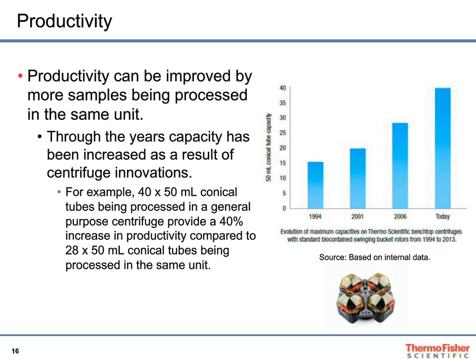You can make a bigger chamber, a bigger rotor, and you get to higher speeds, all those things. So carbon fiber actually does something a little bit unexpected. It makes the centrifuges either at the same size do more or do what you used to do in a much smaller package. So that's kind of what this chart is showing, because over the years, we've gotten to where we've been able to move up to here.